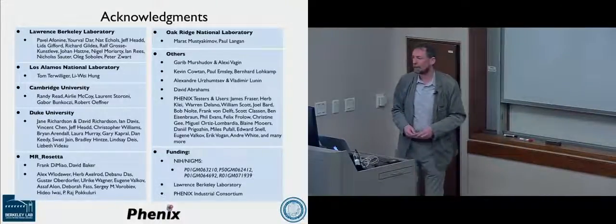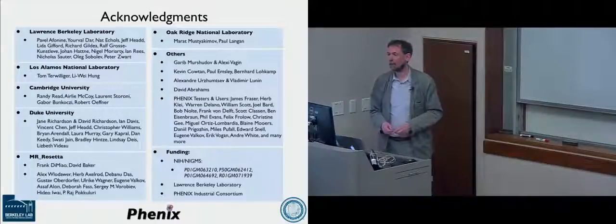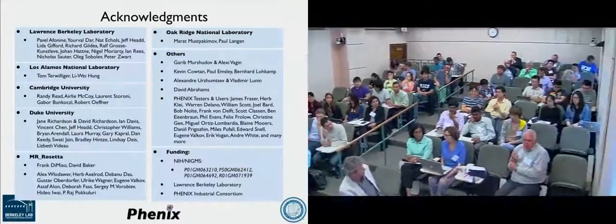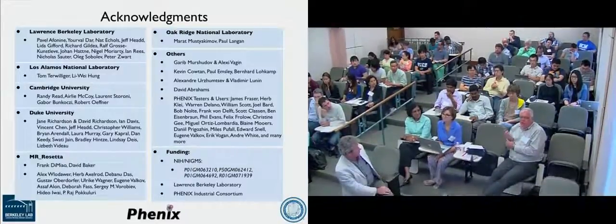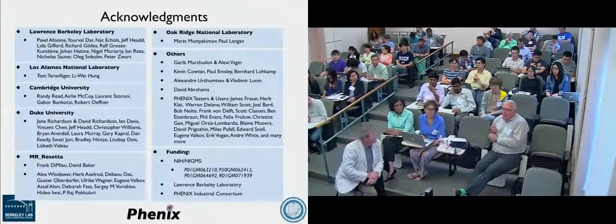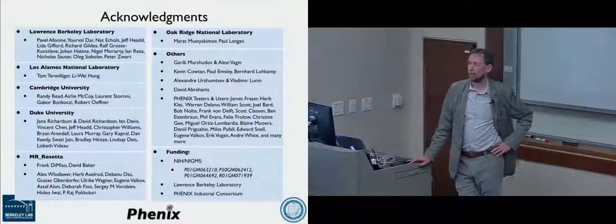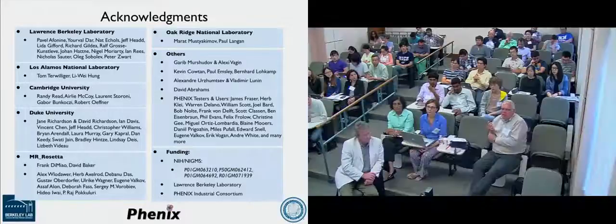Well, right after molecular dynamics was introduced, there were a spate of incorrect structures until the free R factor was developed. I'm just wondering, given you have more powerful tools to move atoms around to better fit the data, is a free R immediately being applied to the MR Rosetta or the morphing?